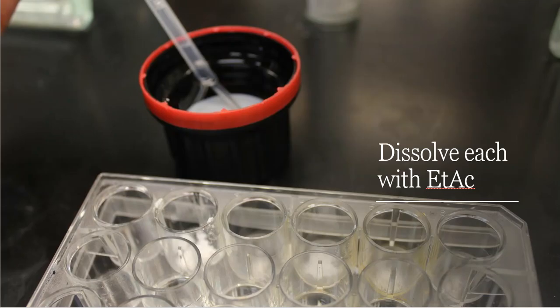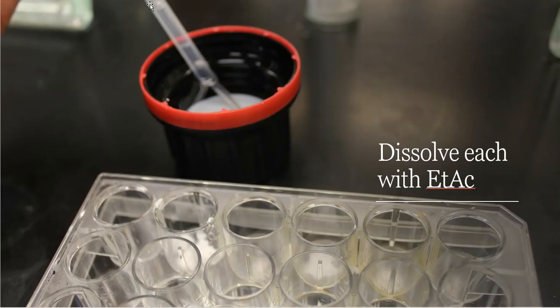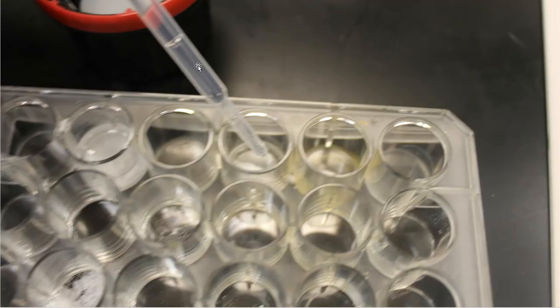So the next part of the lab experiment is going to tell me to dissolve each of these. Now, it says dissolve. It doesn't say that these will fully dissolve. It just says add the solvent to each one, mix it up, stir it up, and dissolve as much as possible. Okay? So I'm going to take 2 milliliters of ethyl acetate. It does not have to be perfect, so that's why you're seeing me use one of these plastic disposable pipettes here. Each one of these has markings on the pipette. You can kind of see that here and way up here at the top.